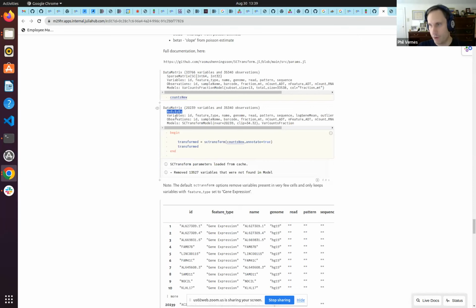So it's this dynamic program that will happen downstream, later on, which is why we have this suspended lazy evaluation. Why is this even here? If you look at the original, before we did this transformation, there was no such thing. We just had a sparse matrix. That's it. Now we have an equation. We have AX plus B1, B2.